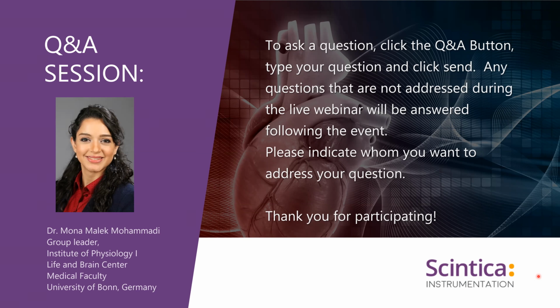That's a good idea. Another question that's come in is, what animal strains are best to use for the neonatal mice model, and why would you recommend those animal strains? I would recommend CD1 mice because they have a larger litter size, better nursing behavior and larger pups. So it makes life much easier. And if you have to use other mouse strains, for example, Black 6, it's good to have CD1 mice as a foster mother to help reduce the cannibalization rate.